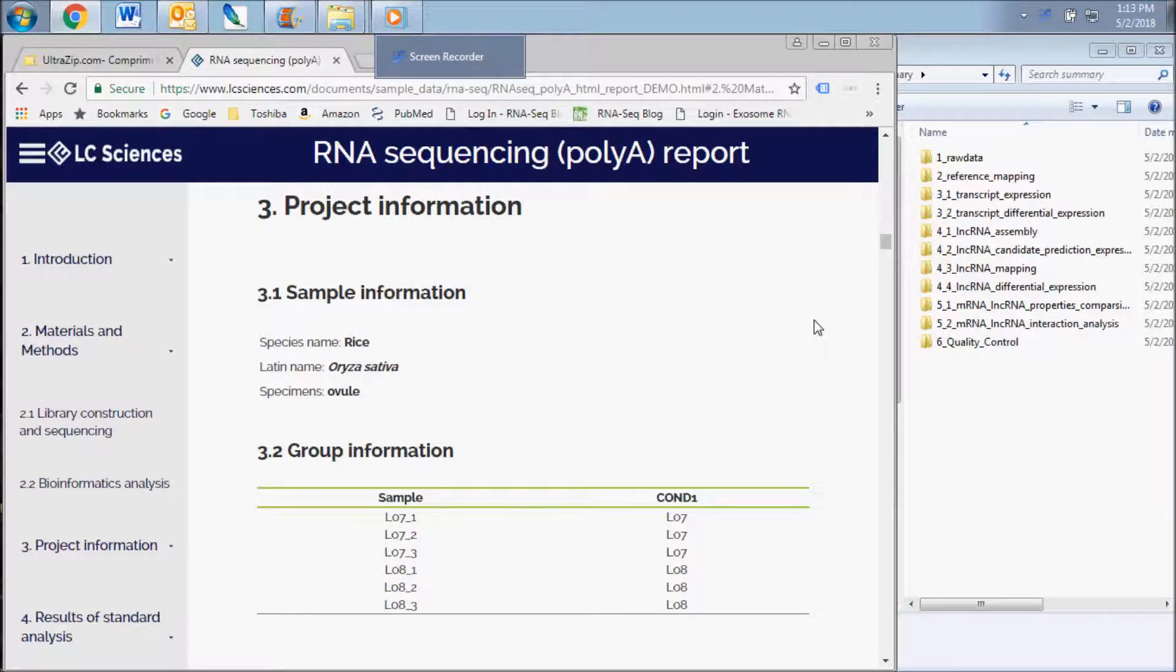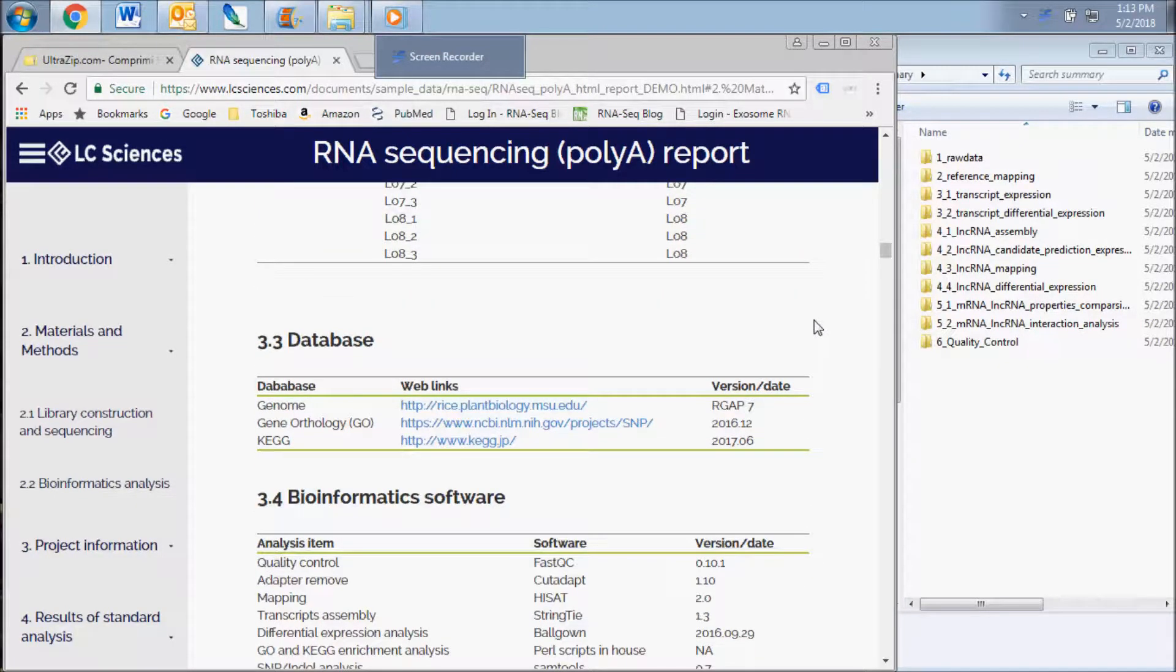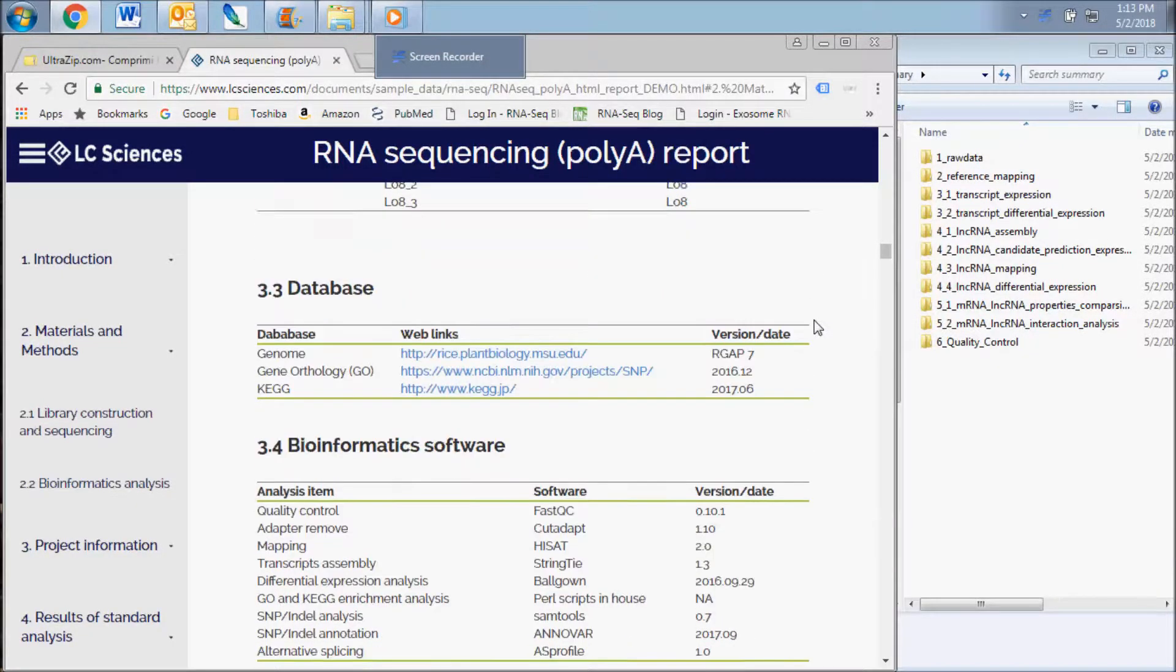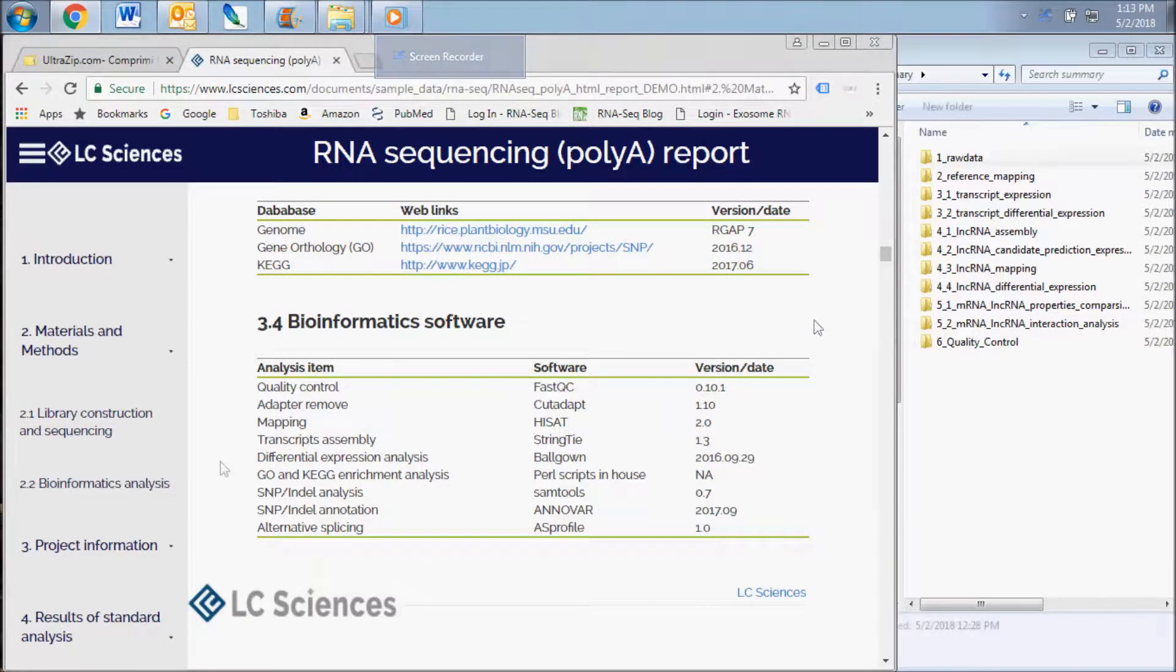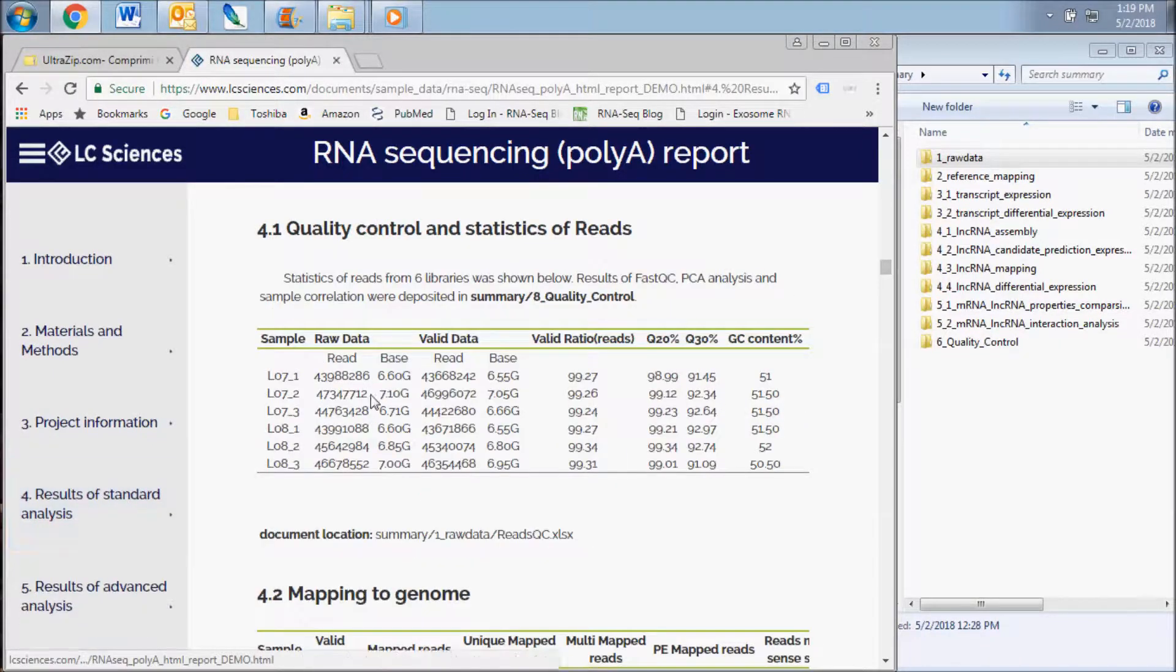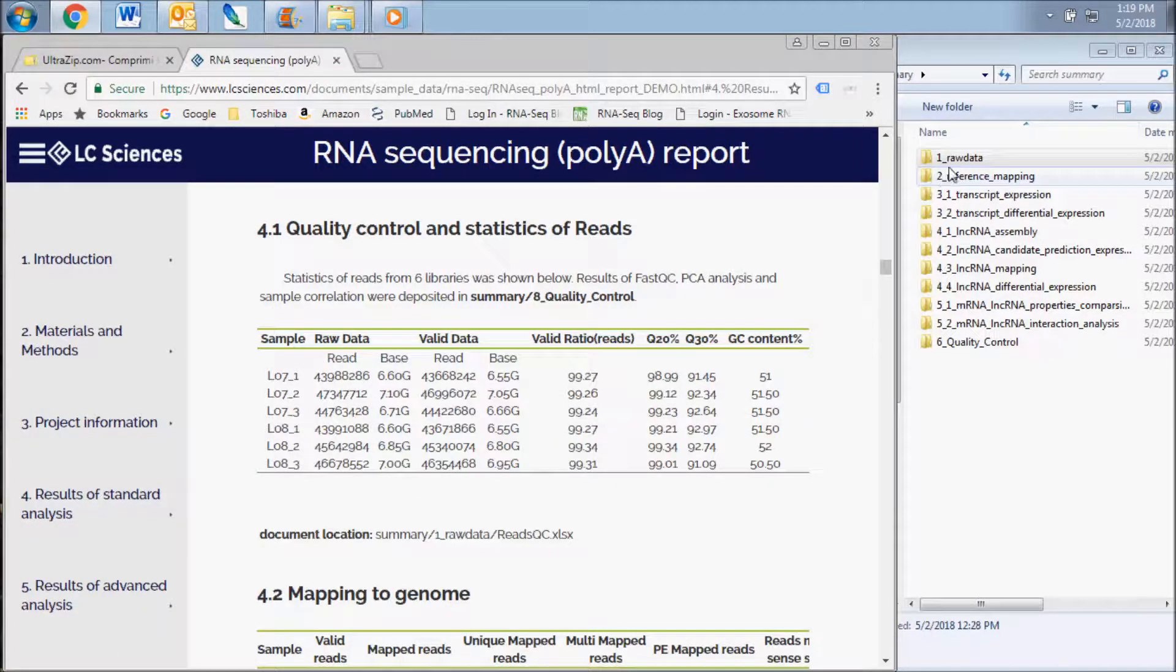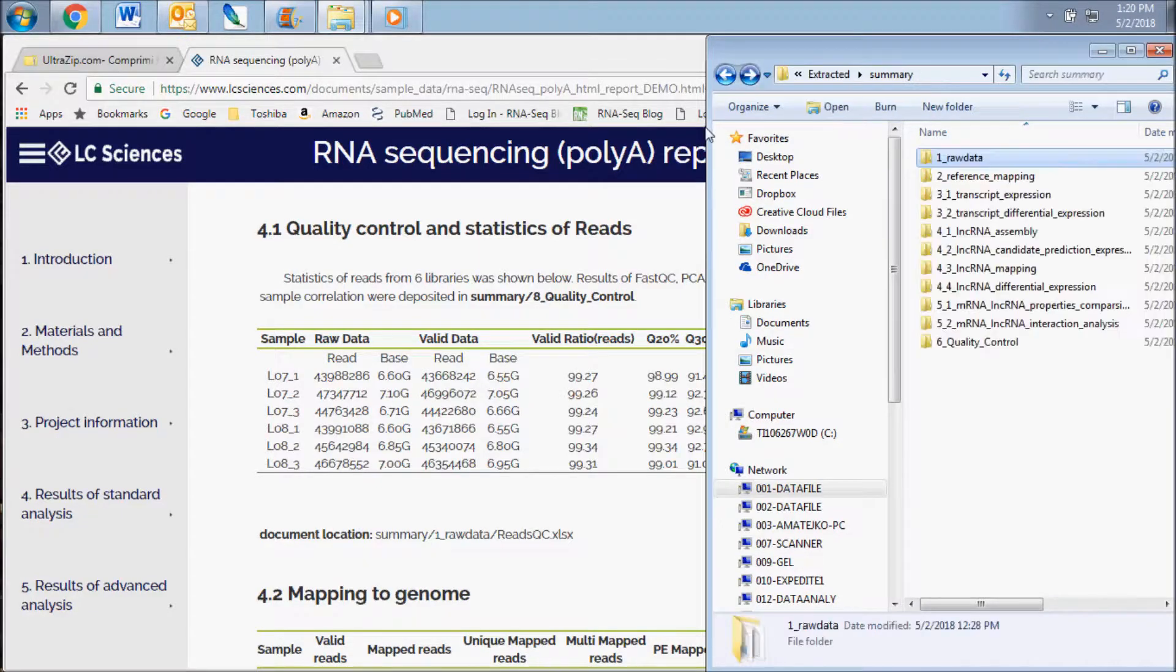The next section describes the details of your project, your samples, the databases used for sequence alignment, and the specific software used for the data analysis. The first results subsection gives you an overview of the read characteristics of the sequencing results.